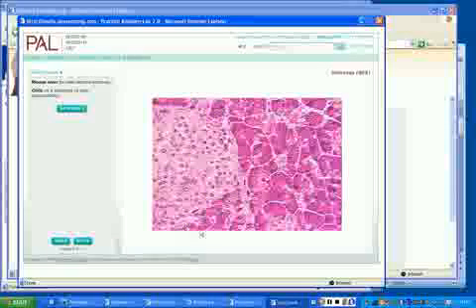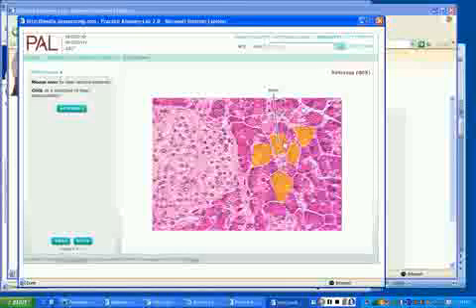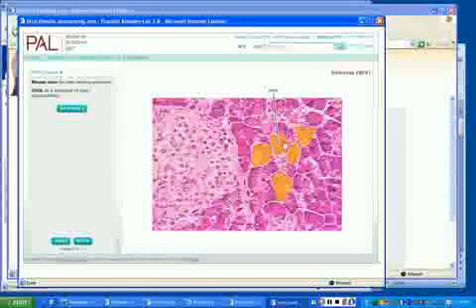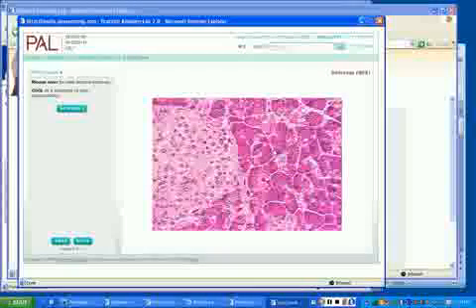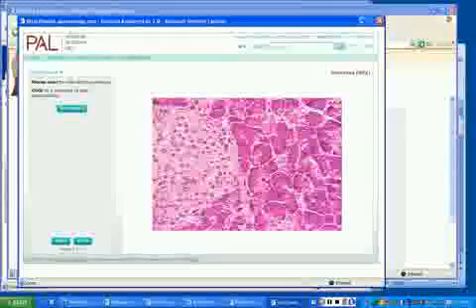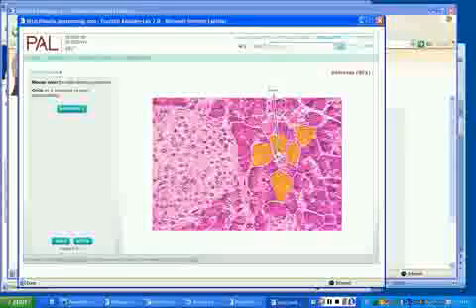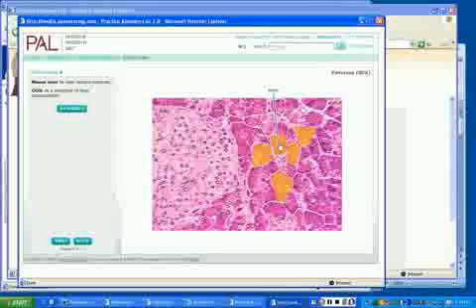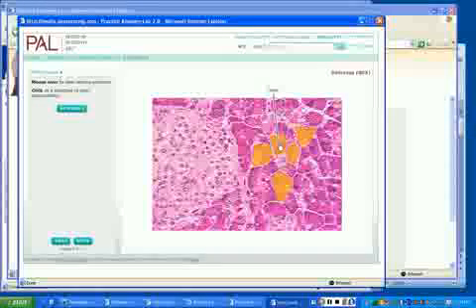Exocrine and pancreatic acini. Correct. It's called the pancreatic acini, and it's the endocrine. Sorry, exocrine. Heard that word come out of my mouth. That's not right. Exocrine part of the pancreas. Name the hormones produced here. Where the pointer is.